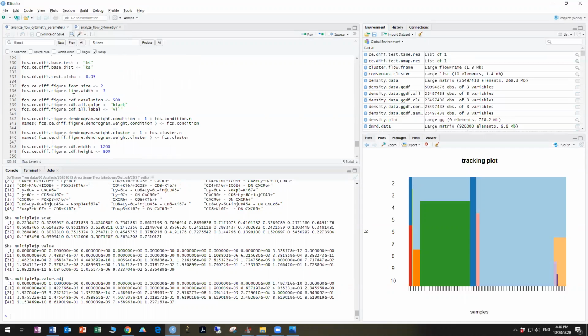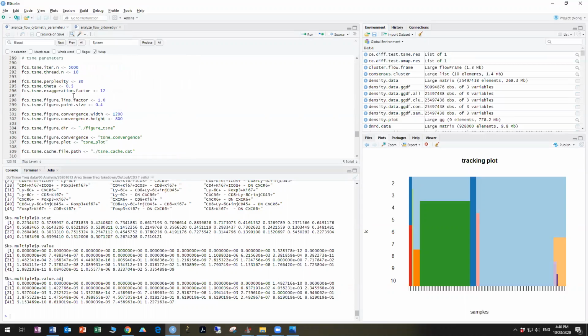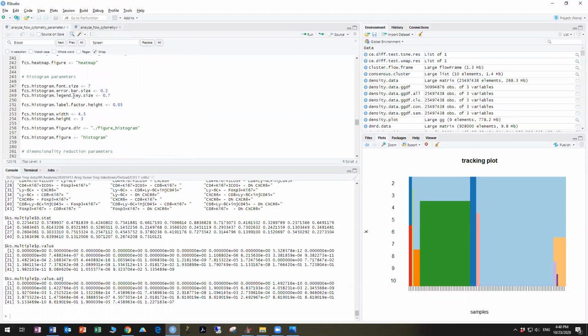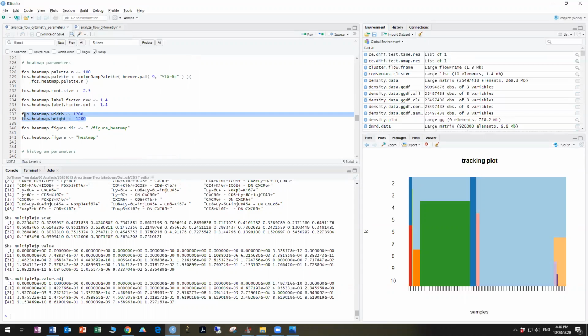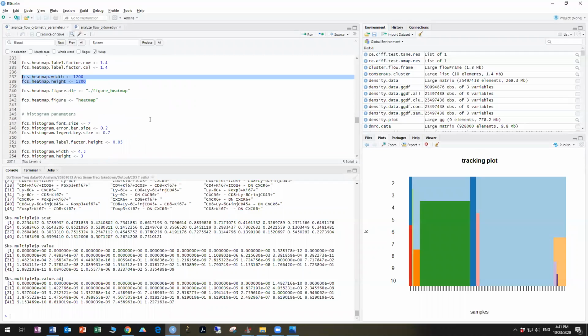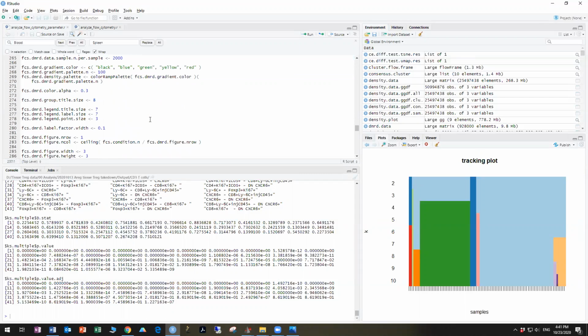All right, and that's basically it. Let's touch quickly on a couple of things about how to change the data output in terms of the graphics. So we looked earlier at changing the heat map to get the scale on screen. You can do the same thing with your dimensionality reduction figures, so your t-SNE and your UMAP plots. So you have all of these different parameters. Each one changes something, so the legend titles, the legend label size, these fonts.